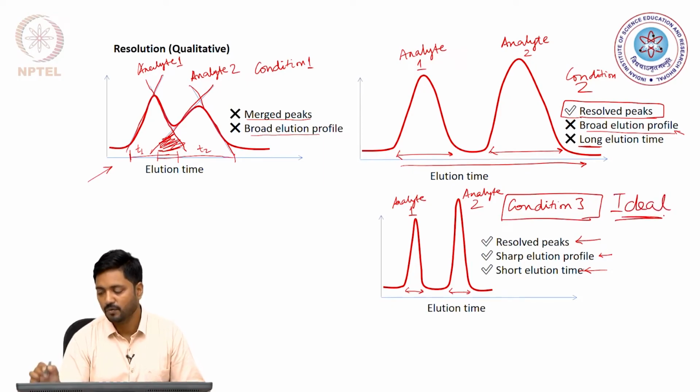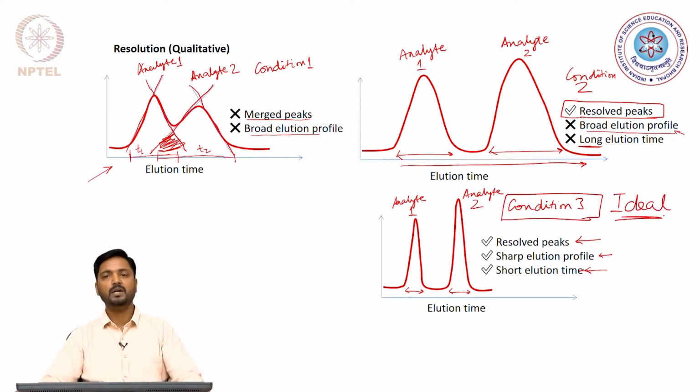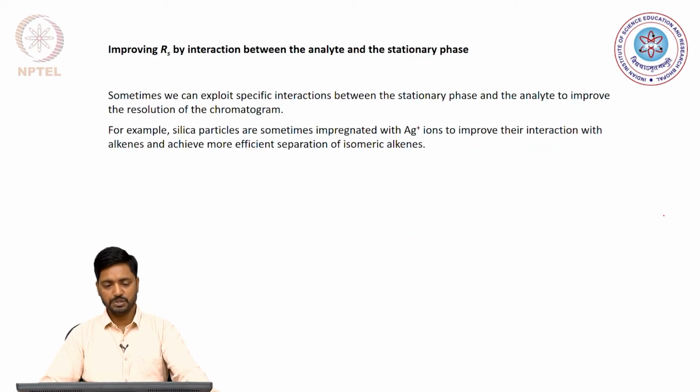So, this is our ideal case scenario, and chromatography people strive to achieve chromatograms that are sharp, well resolved, and still require short elution times. Now, after attaining this qualitative understanding of the resolution, let us try to see if we can have a quantitative understanding of the resolution.